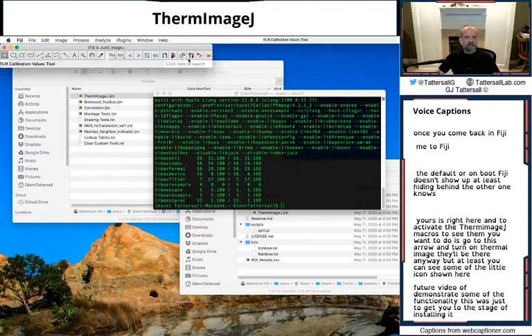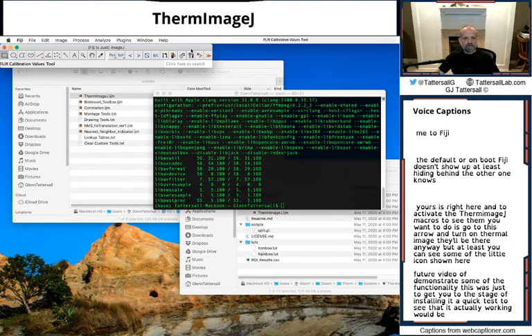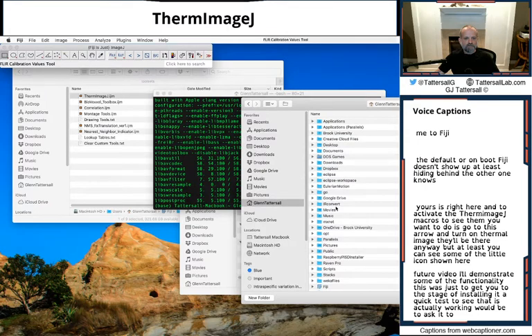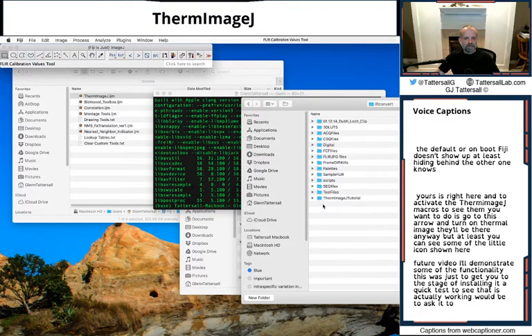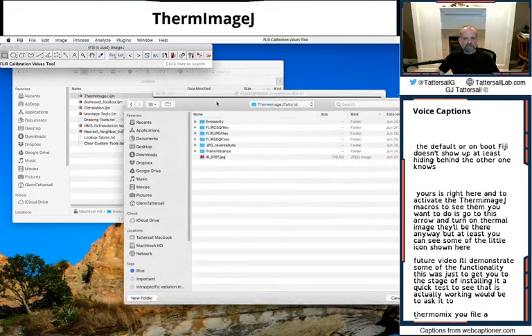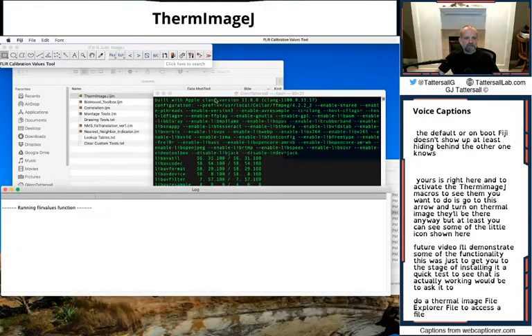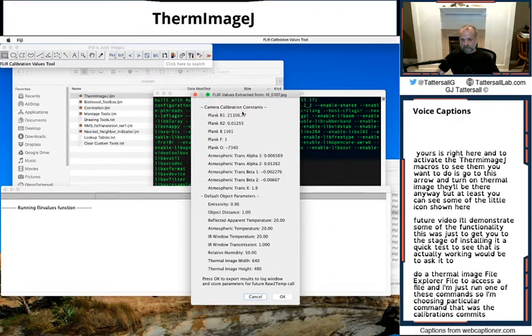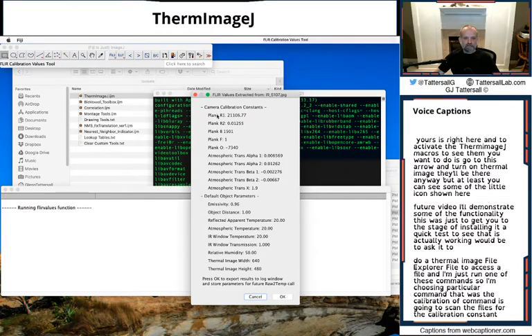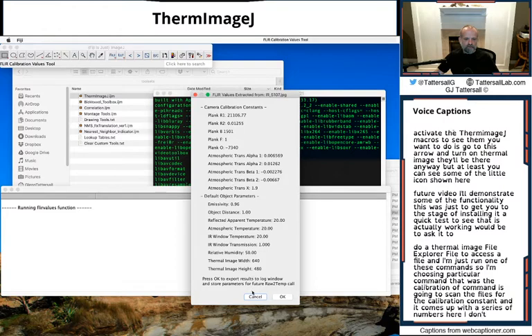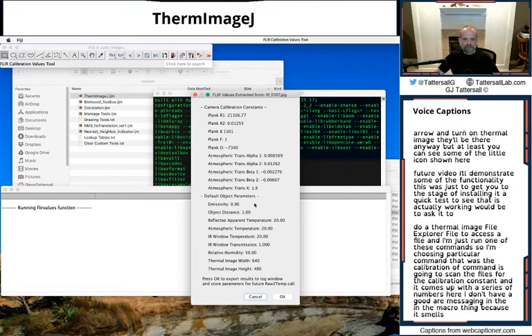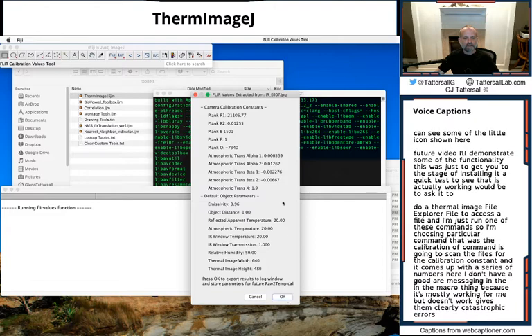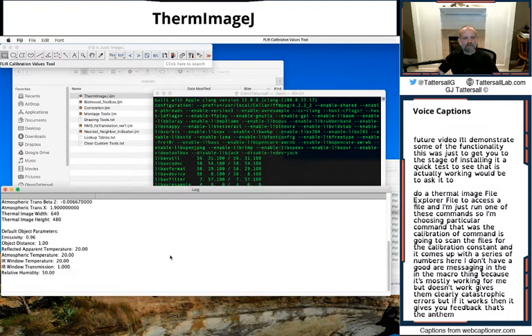A quick test to see that it's actually working would be to ask it to view a ThermImageJ file, a FLIR file. So access a file. Just run one of these commands. So I'm choosing a particular command that was the calibration command. It's going to scan the file for the calibration constants. And it comes up with a series of numbers here. I don't have good error messaging in the macro thing because it's mostly written for me. But if it doesn't work, it doesn't work. It gives clearly catastrophic errors. But if it works, then it gives you feedback that's the information we want.